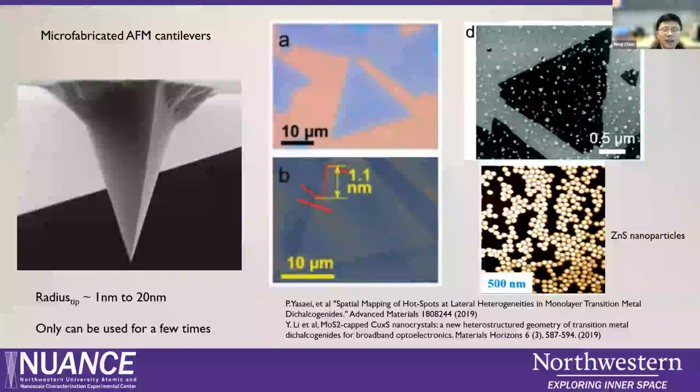So here on the left shows what the AFM tip looks like. And before I show you the stylus profilometer, that tip really has a big angle and also uses a diamond. They use a diamond to make the tip. It's very sturdy, very durable. Typically, the stylus we can use for a year, 2 years. We don't need to change it.